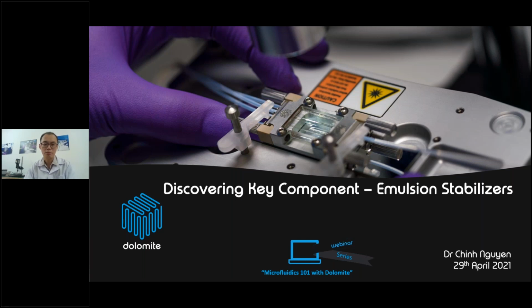So today's webinar is one of a webinar series we call Microfluidics 101 with Dolomite, held on the last Thursday of each month throughout 2021. Today, the topic of the webinar is emulsion stabilizers. We will learn about what emulsion stabilizers are and how to use them in microfluidic production.